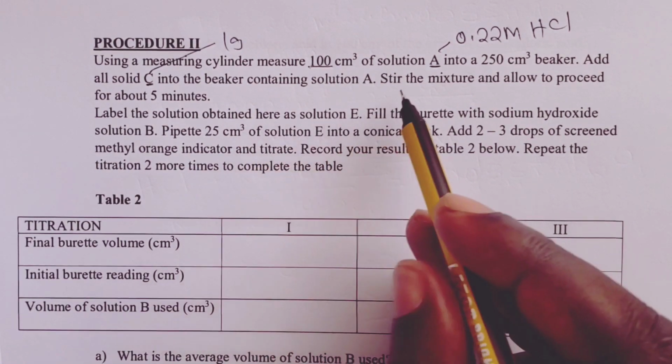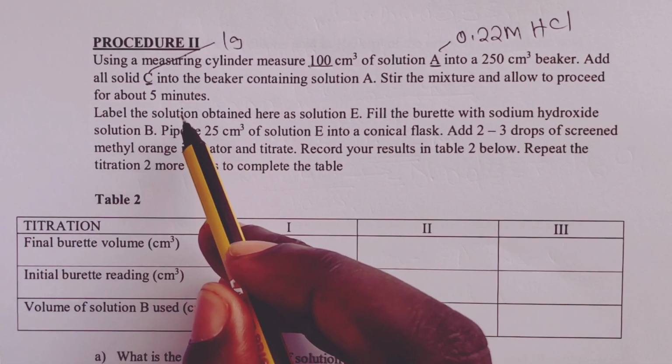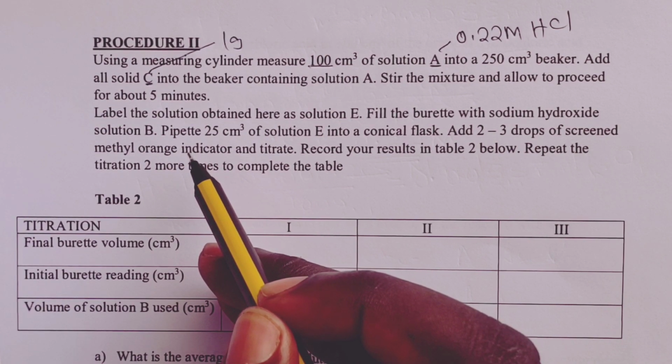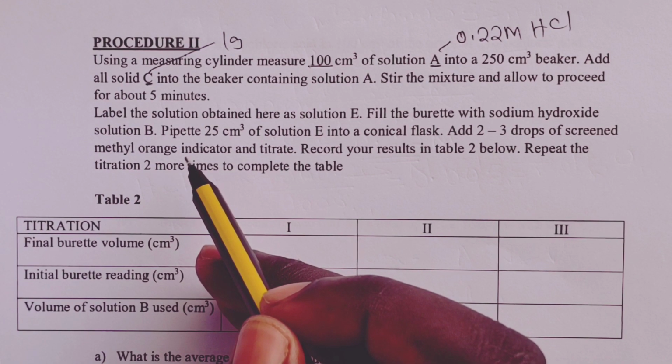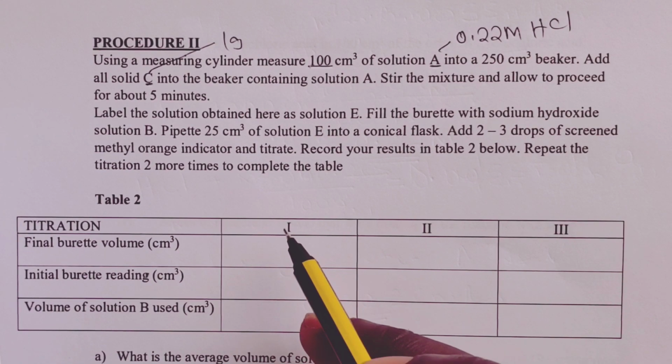Solid C is 1 gram of an impure carbonate. So we would stir the mixture and allow it to proceed for about 5 minutes. This is to ensure that all the carbonate has been used up, but we shall have some excess acid that we shall now titrate a second time against our alkali.